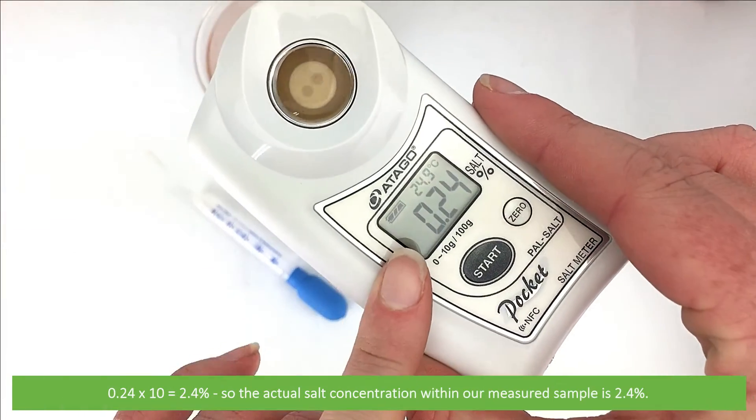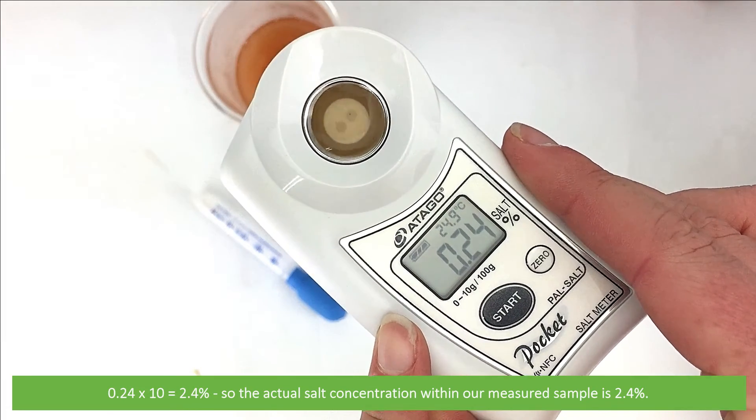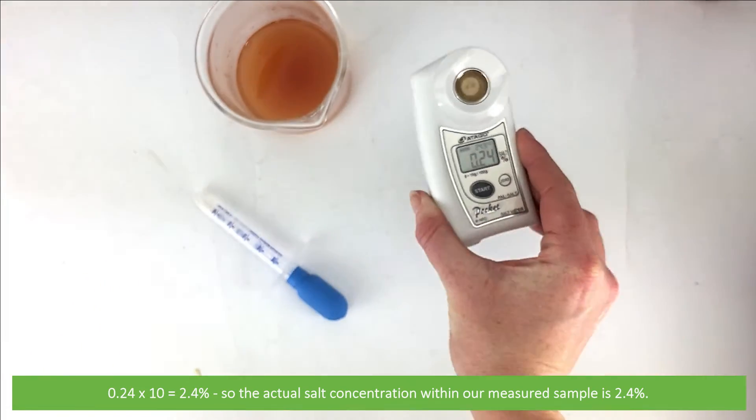So for a reading of 0.24, we multiply that by 10 to get 2.4%. The actual salt concentration within our measured sample is 2.4%.